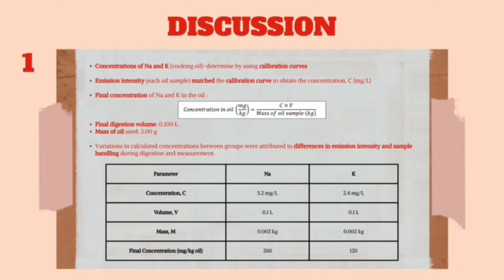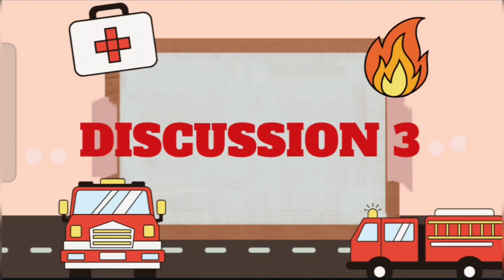milligrams per liter, and then we inserted the concentration value into the formula of C times V over mass of oil sample. We obtained the final concentration of sodium as 260 milligrams per kilogram, and potassium as 120 milligrams per kilogram.